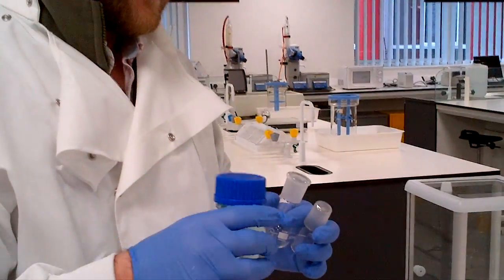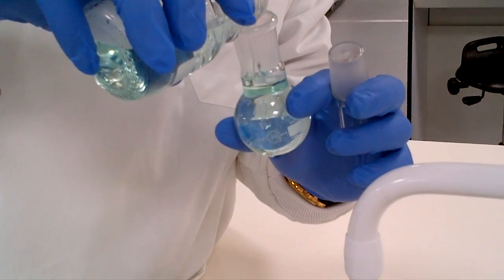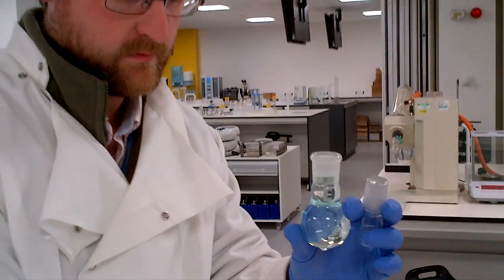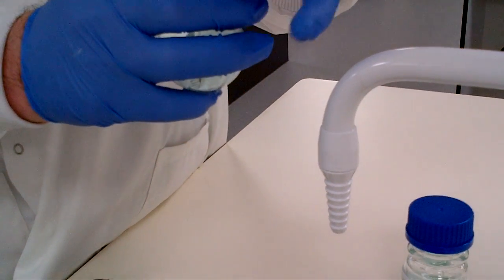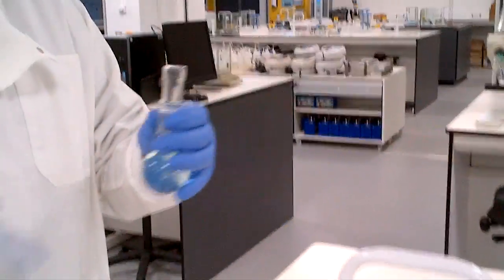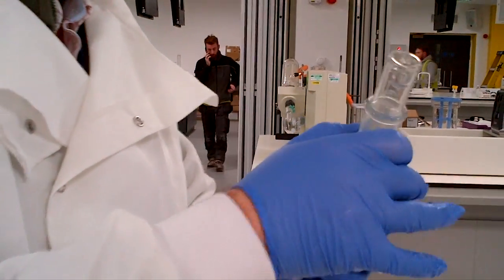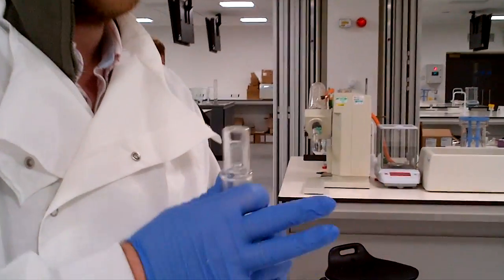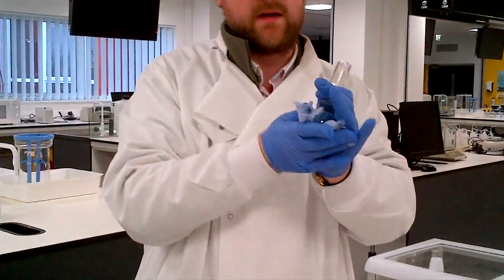You've to then take some of the unknown liquid and then put it into the vessel. So drizzle in. Make this run towards the top. Stopper goes down, and you'll notice now some of the solution comes out to the top of the flask. So again, grab yourself your tissue paper, and with steady and firm hands give this a nice clean. You might need a second or third piece of tissue paper at this point. That's clean and dry.